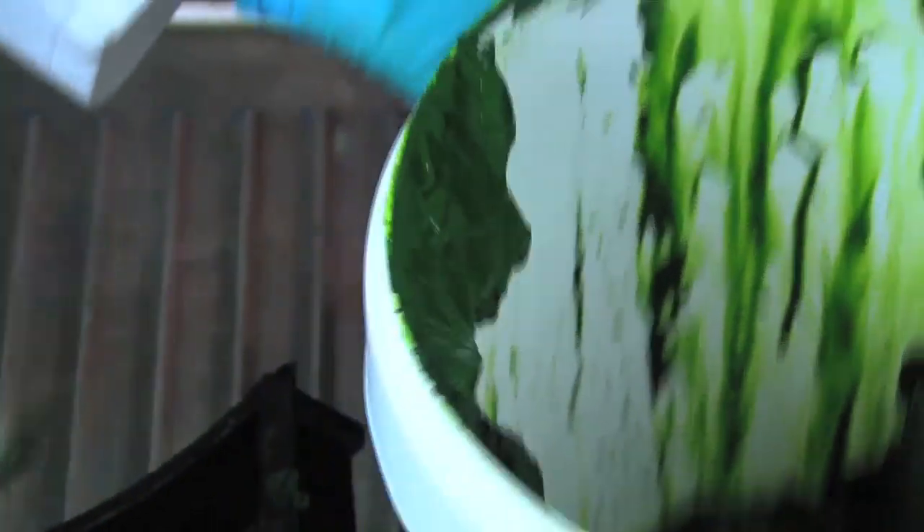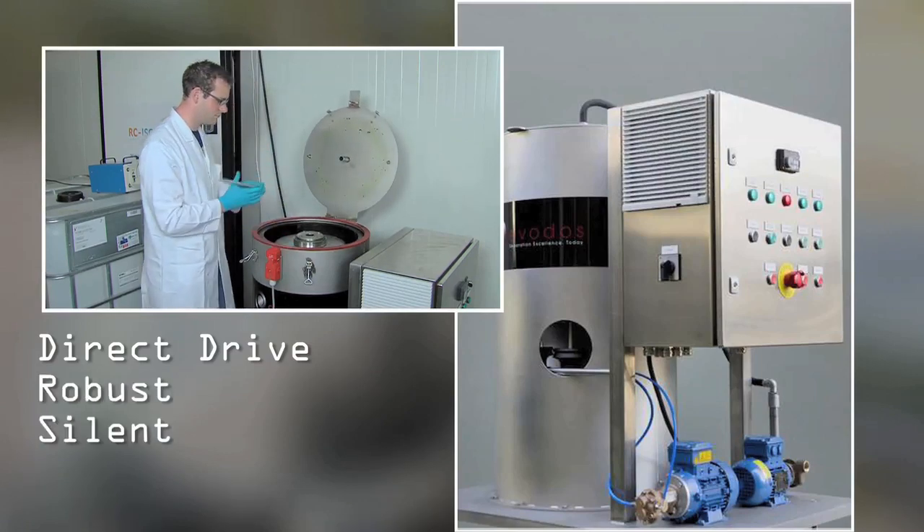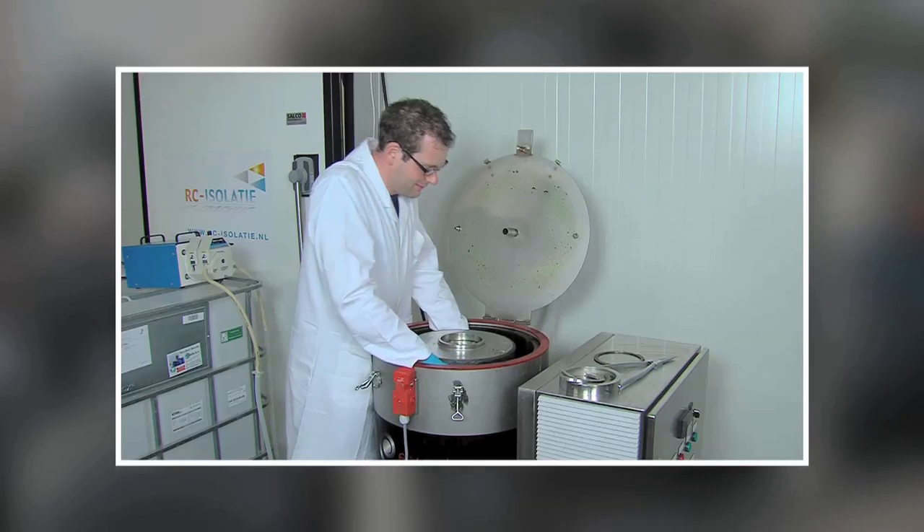The machine is direct drive, robust, silent and simple. No balancing is needed, never. This all results in a minimum of maintenance and no special tools are required.